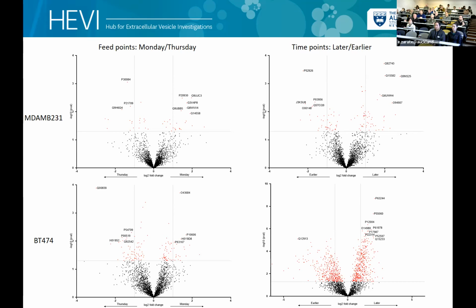And overall, proteomics and SWATH in particular is a powerful and useful tool in our field, and it finds more and more application with projects similar to this.